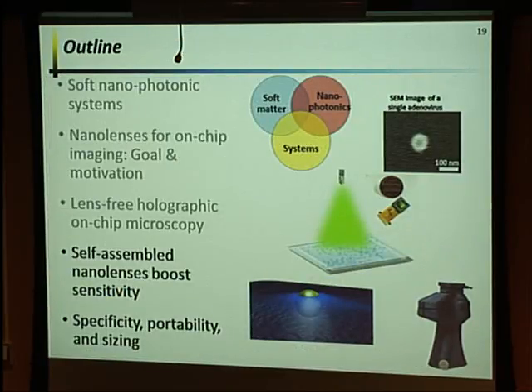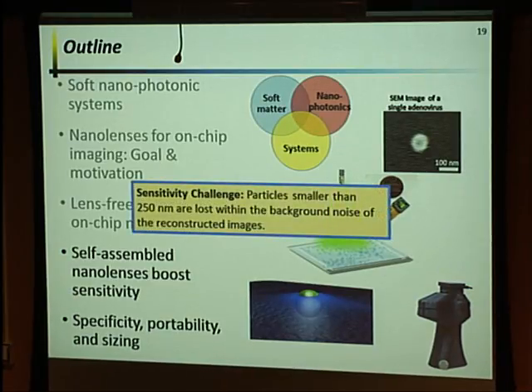So that's the idea behind lens-free holographic on-chip microscopy. We get the advantage of high resolution and large field of view, portability, very cheap, very cost-effective, these sorts of ideas. But there's still a sensitivity challenge, and the sensitivity challenge is that particles smaller than about 250 nanometers are lost within the background noise of the reconstructed images. So we want to be able to get down below this size.